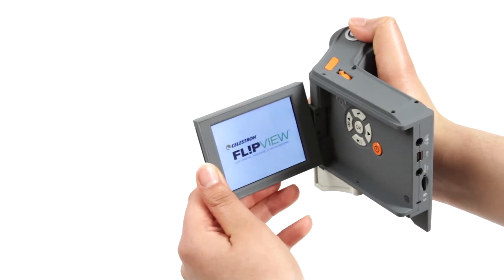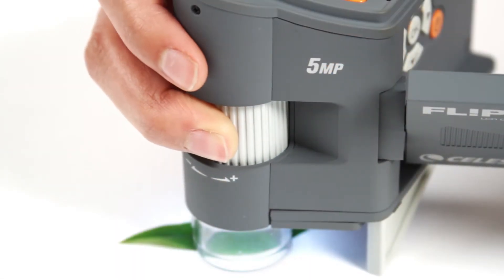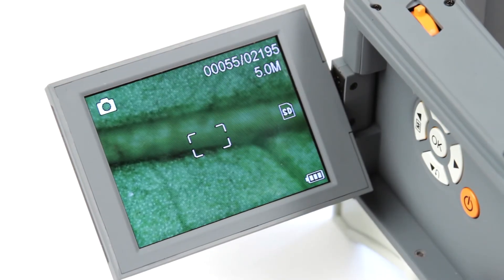Celestron's FlipView microscope includes a 3-inch full-color LCD screen that flips out and up for the perfect viewing angle. Bring your object into sharp focus with the 5-element infrared-reducing full-glass lens, 5-megapixel sensor, and LCD screen.